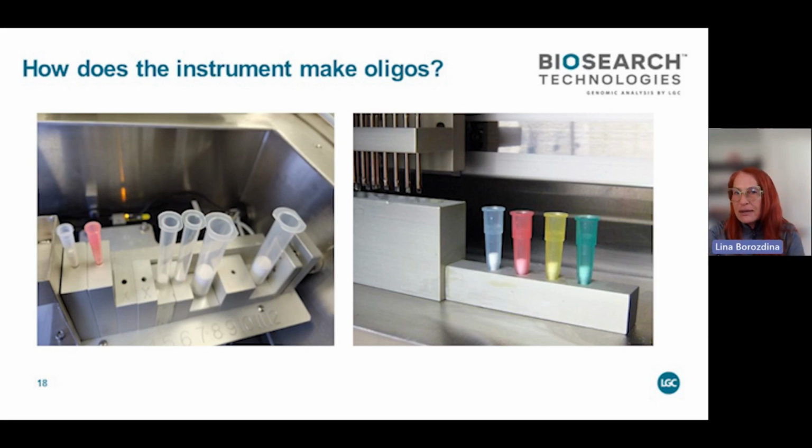You don't have to run separate syntheses for each of the sizes. So how the instrument works, there is a slide that you put your columns into. There's a line underneath the slide that goes either to the trityl monitor or through the waste. And the slide goes back and forth, right to left. In the case of our two X synthesizers, which are the 48 and 192 X's, it's an XYZ synthesis.